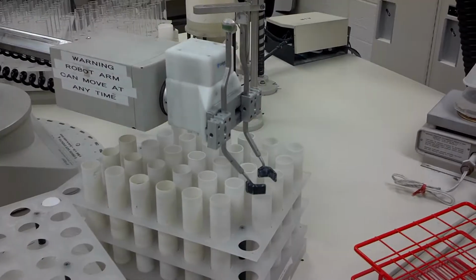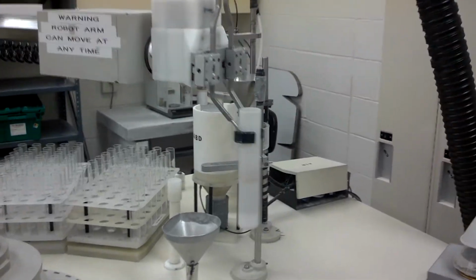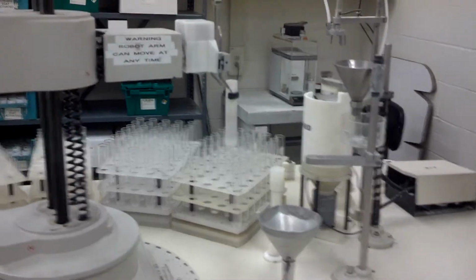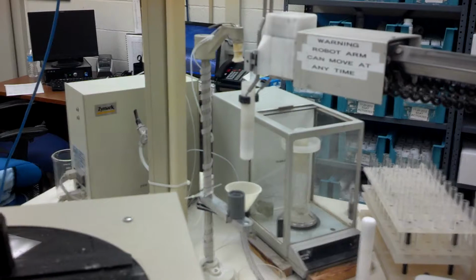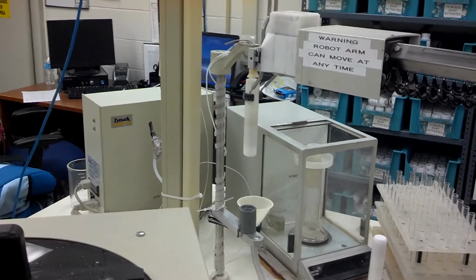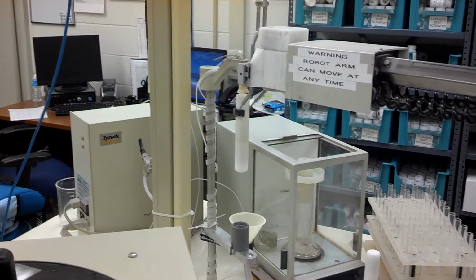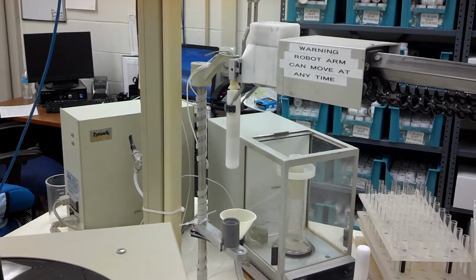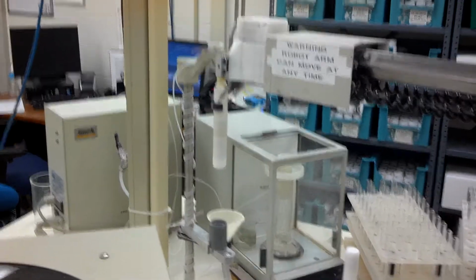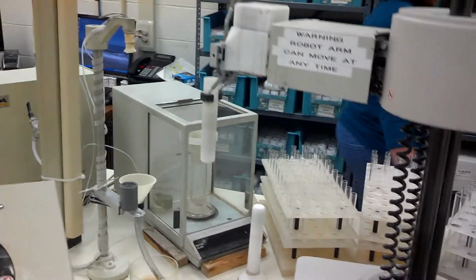So that little tube was empty, and then we put the powder into the tube, that's right? Mm-hmm. And now we're picking this large tube in order to dispense the water. Yeah, now what's the reason for the size of that thing? Why couldn't we just put it directly into the... Well, that's my point. I think a lot of it is possibly unneeded. If you can reduce some steps, I don't know why that was done. Let me ask you, is there some reaction that takes place if you pre-fill the powder already in those little glass vials?